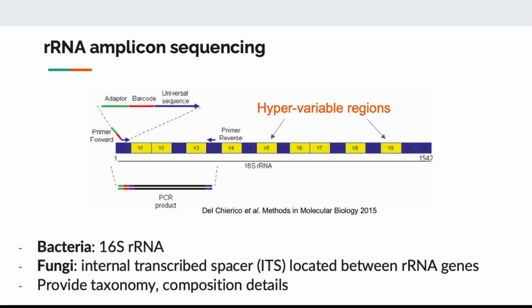Okay. So if you're curious, when we say that we can study bacteria or virus or fungi by studying the ribosomal RNA, the reason is because on ribosomal RNA, there are certain regions that are very conserved. So in whichever bacteria, it's going to look pretty much the same, this blue region. And then there are regions that are variable. So in one bacteria, the sequence will be one thing. In a different bacteria, the sequence will be different. So if you design a primer on the blue region, on the conserved region, you can sequence the variable region.